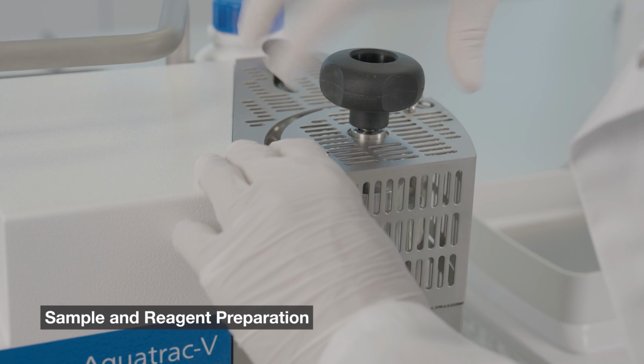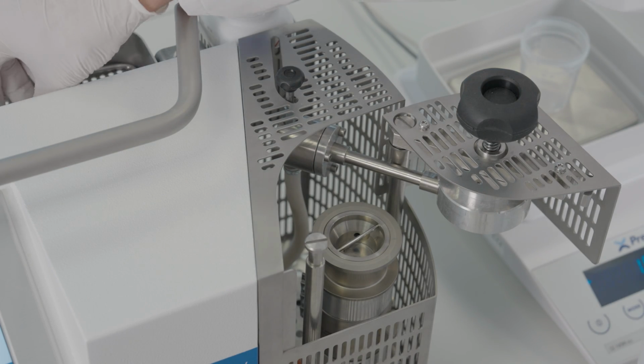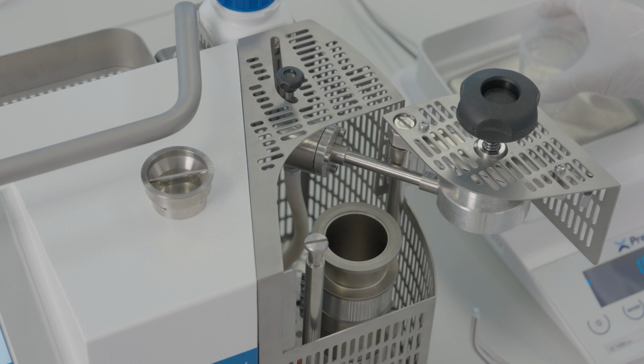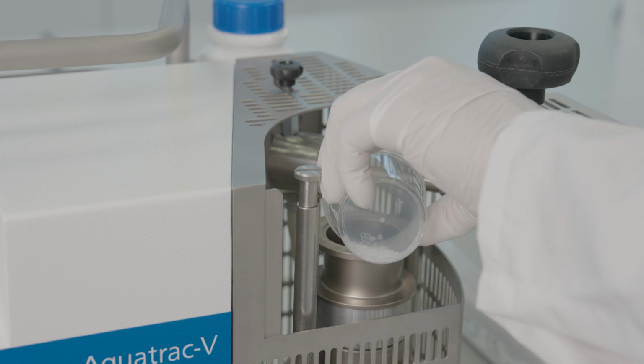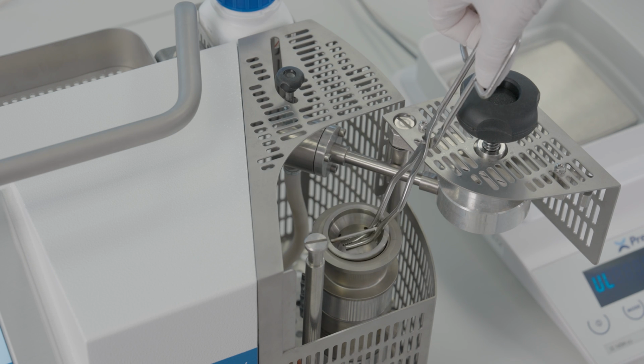Open the measuring chamber. Use the tongs to remove the reagent insert. Fill the measuring cup with the new sample. Use the tongs to place the reagent insert back into the measuring cup.